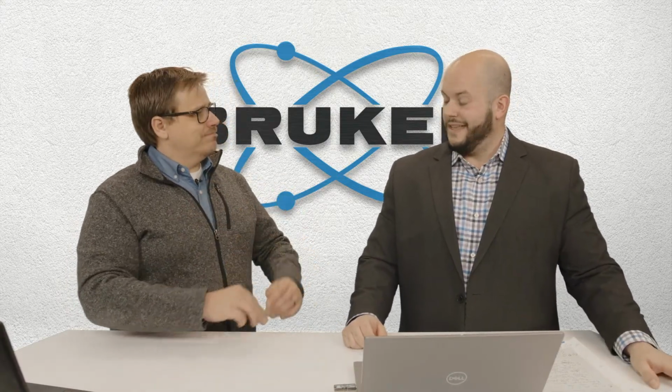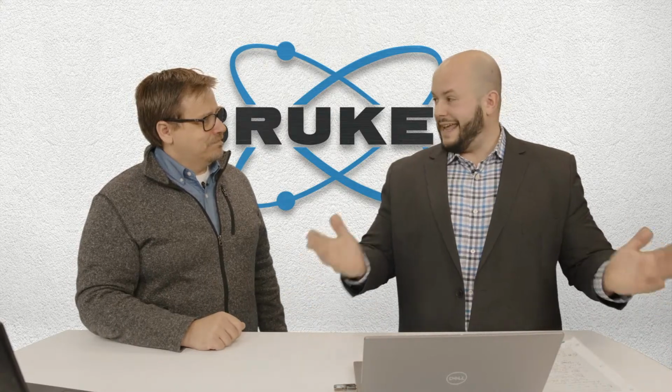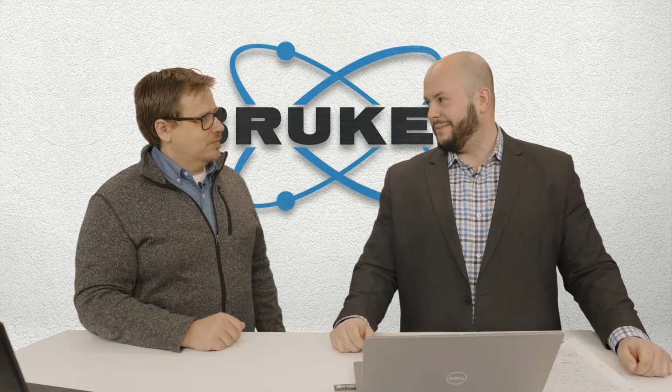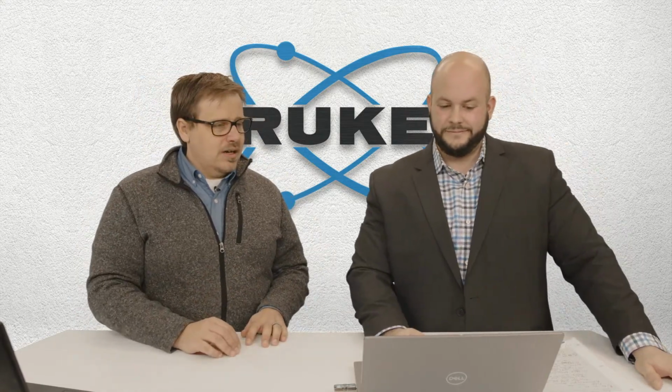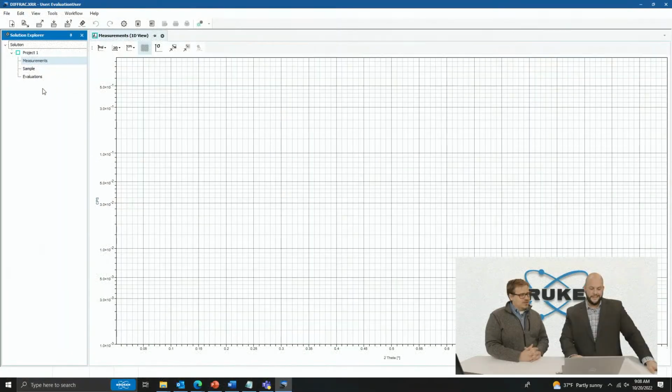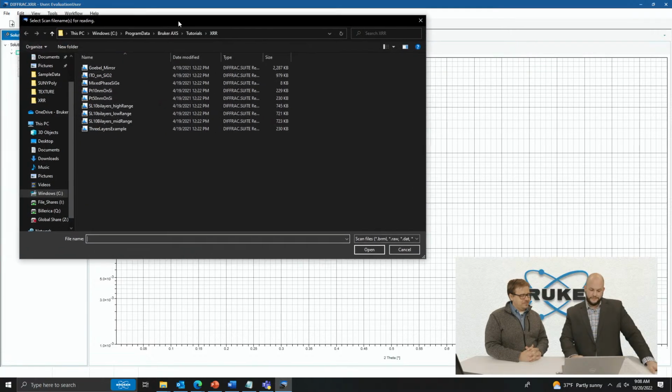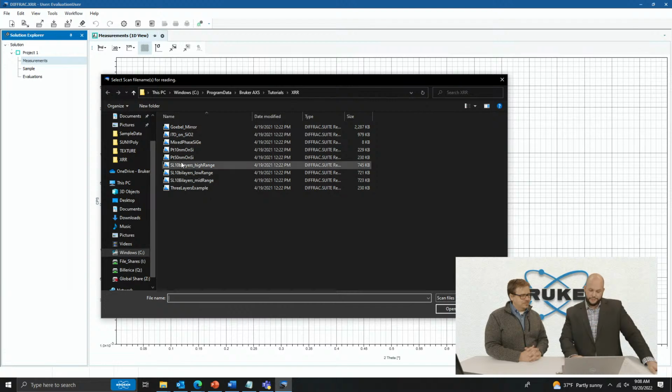Now what do we do with it? Well, if we have good data, we can then analyze that data using our software that Bruker's been developing. All right, great. So DIFFRAC.XRR, that's the software. And we're going to see it in action here, right? So let's take a look. See what it looks like. So here, I'm going to pull in some data. In this case, we're looking at a platinum thin film on silicon.